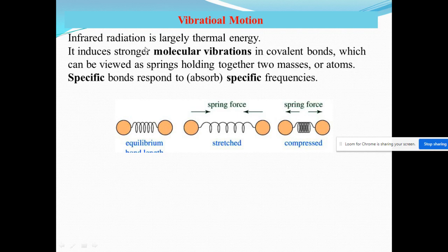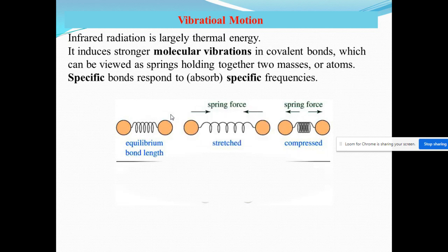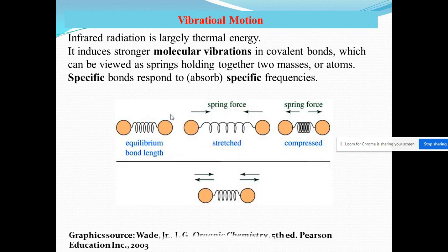From this picture, infrared, we can say that infrared radiation is largely thermal energy. It induces stronger molecular vibration in covalent bonds, which can be viewed as a spring holding together two masses or atoms. Specific bond respond to specific frequency.